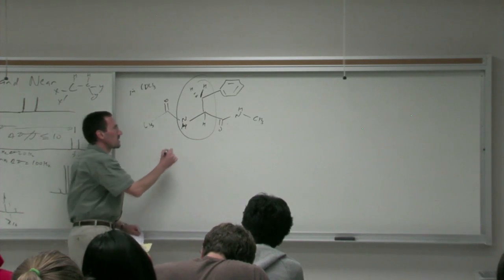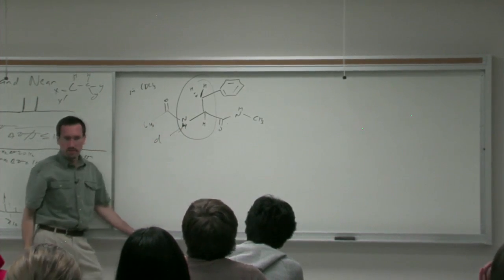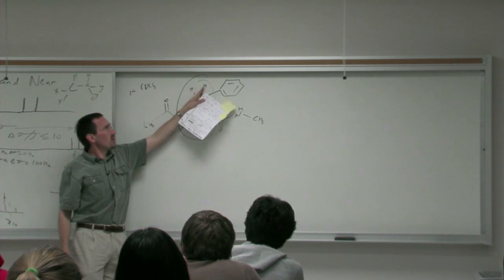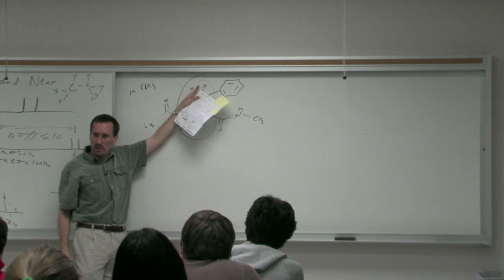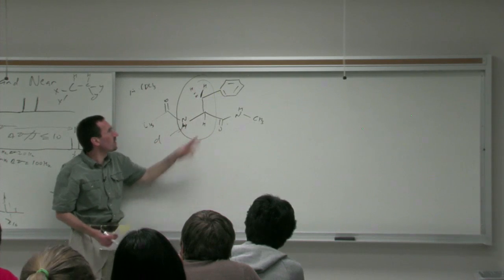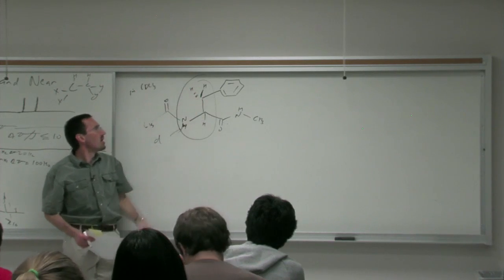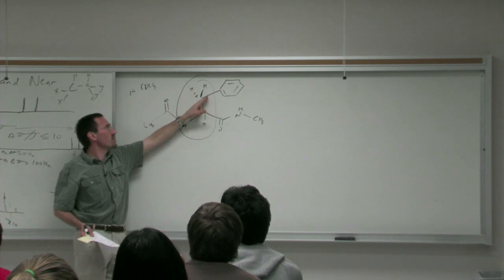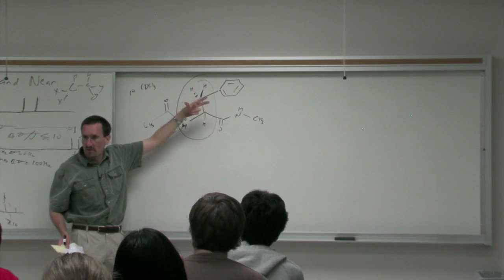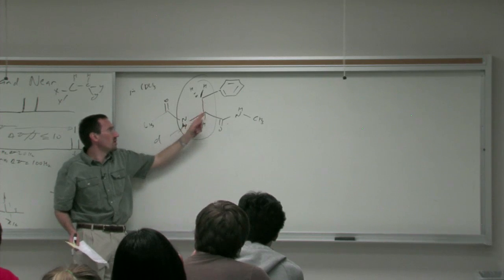And we decided that we had one spin system over here. The multiplicity of this proton of the NH is a doublet because it's split by one coupling partner. Each of these protons is non-chemically equivalent, so they split each other, but they're going to be similar in chemical shift. They're similar in environment, so they'll both be at about 2.5, 3 parts per million. Why do I say about 3 parts per million? Well, they're off of a phenyl group. If we were a methyl group off of a phenyl, I'd say 2 parts per million. It's a methylene, so that pushes it to like 2.5 parts per million.